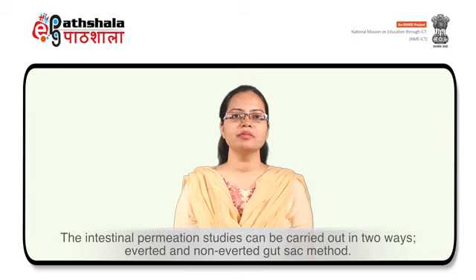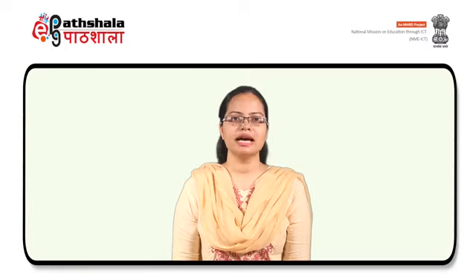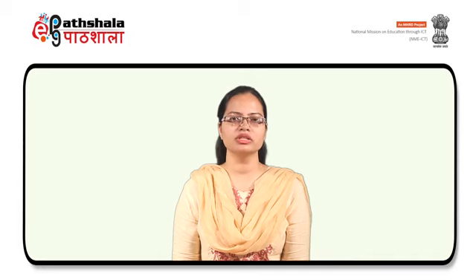The intestinal permeation studies can be carried out in two ways, everted and non-everted gut sac method. The applicability of the non-everted rat intestinal sac method has been extensively reported in the literature and has revealed a good relationship between the permeability of model drugs and their corresponding human absorption.